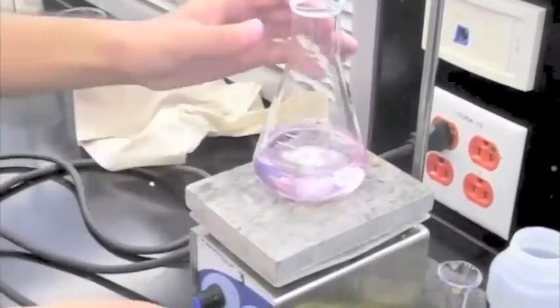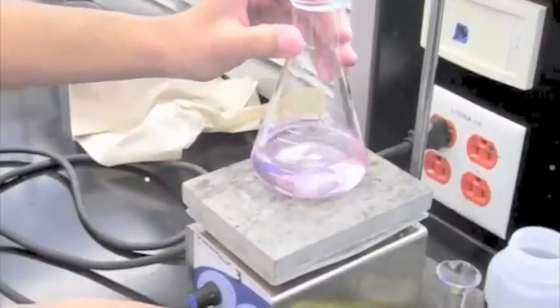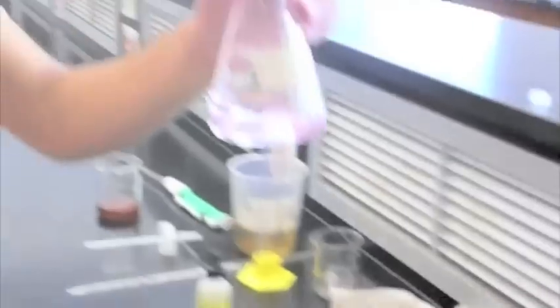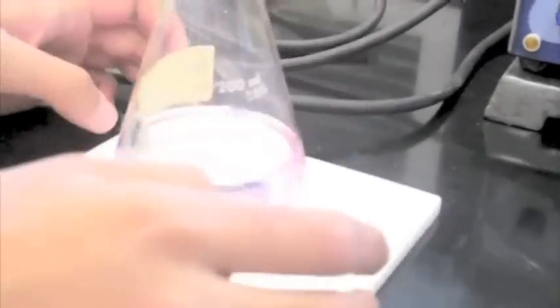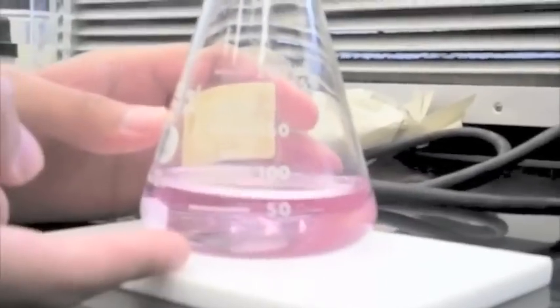The collection in the flask is set next to a white object where you can see clearly the distinction in color. From here, note how many milliliters of NaOH was used for the titration.